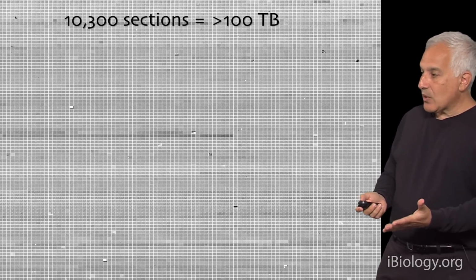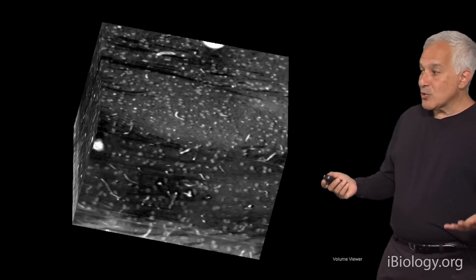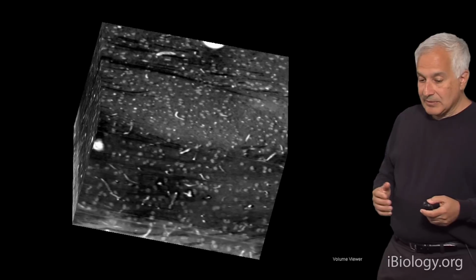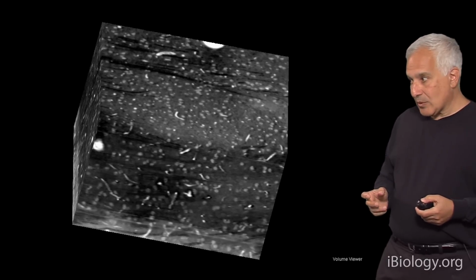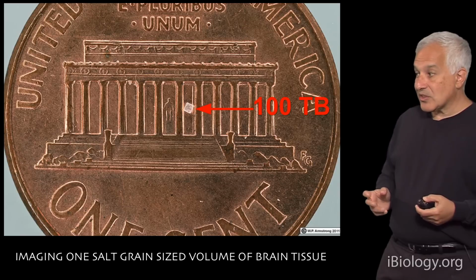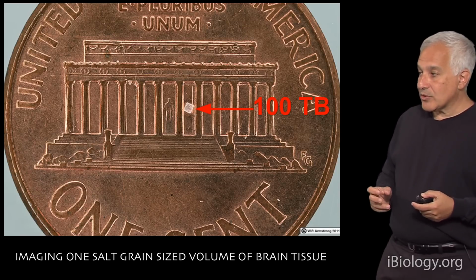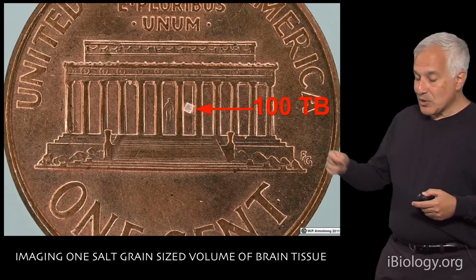So what do you get when you take all these images and stack them up? You generate a 100 terabyte data set, in this case of thalamus. It's a lot of data, and in some ways very impressive. In another way, not so impressive. If you actually look at the size of that data set, it's about the size of a grain of salt. You could take this data with a grain of salt, if you will, but it took us a long time.